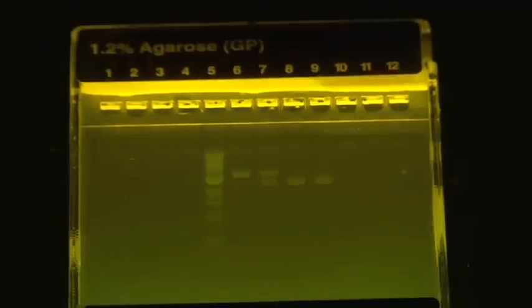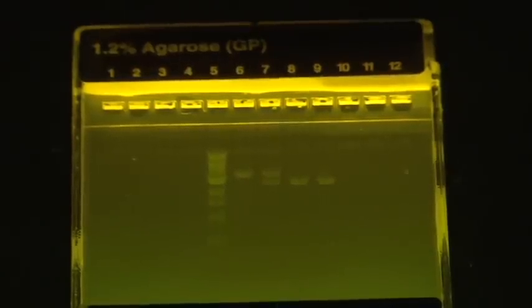So what I'd like you to do now is take a moment to discuss why you think it is that some people show one band, whereas other people show multiple bands. I'd like you to write down for each person how many bands that you see, whether those bands are longer or shorter, and then also explain why some people show multiple bands and some people show one band. We'll discuss the answers to these questions when we come back.